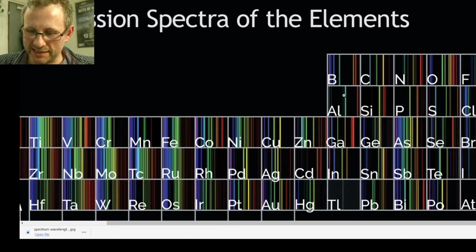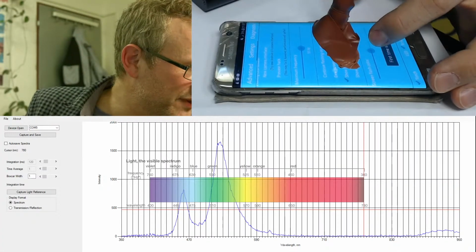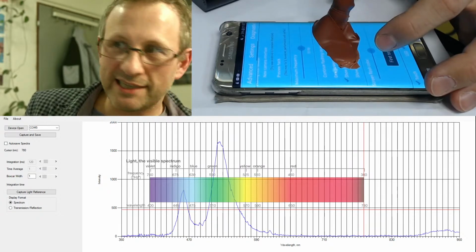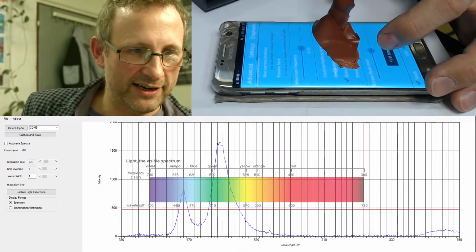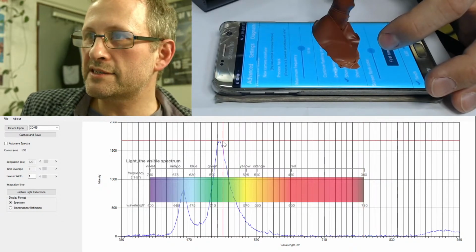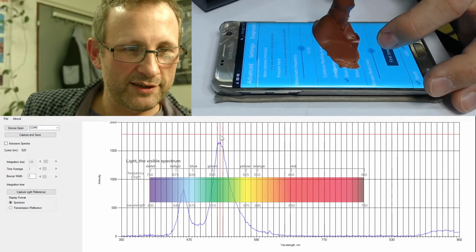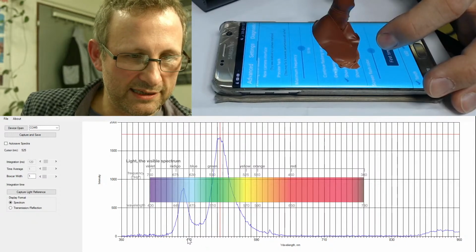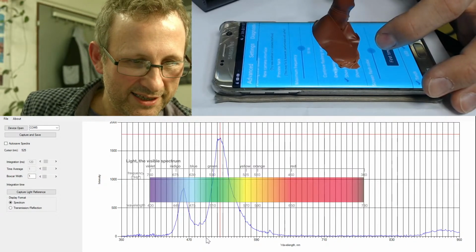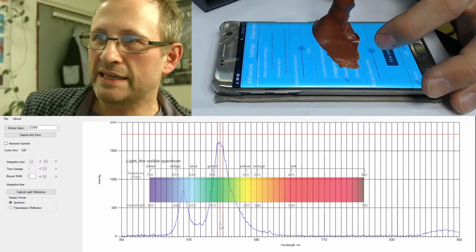And so how would that translate to this? Well, you would see something that would be probably a lot tighter than what we are seeing here. This area here is the green line. In fact, this has some software, and you can actually move the pointer around, and it gives you a better idea of where you are focusing. So it's this kind of a 10. This is 480, 490, 500, 510, 520, 525 nanometers here.